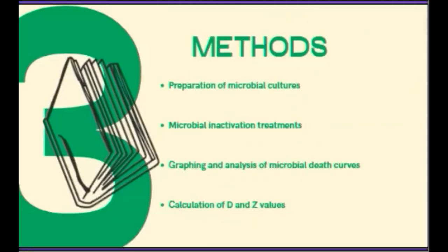Okay. And the next part is the methods. The first part of this laboratory is the preparation of microbiological cultures. First, inoculate the microbiological strain of interest into the Erlenmeyer flask containing the liquid culture medium.